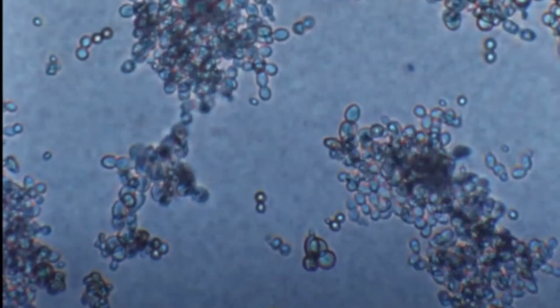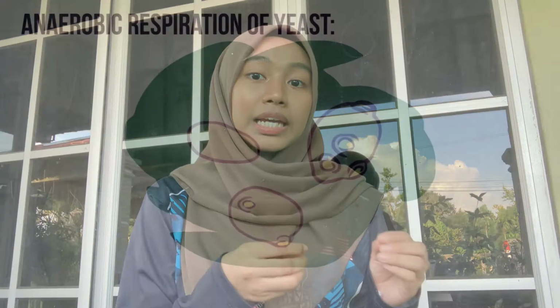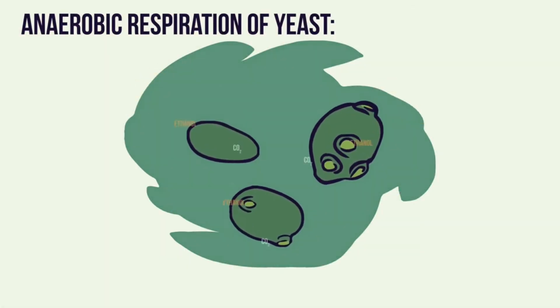So, have you guys seen the result just now? It's really accelerating, right? Okay, here is the principle. Yeast is a fungus and needs a supply of energy for its living and growth. Yeast can use oxygen to release the energy from sugar in the process called respiration.